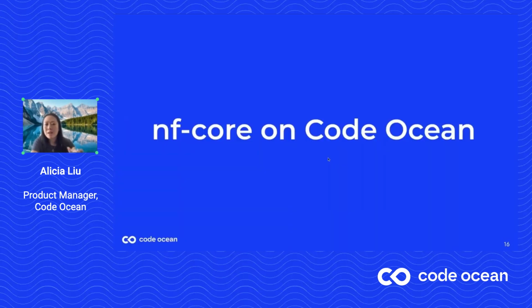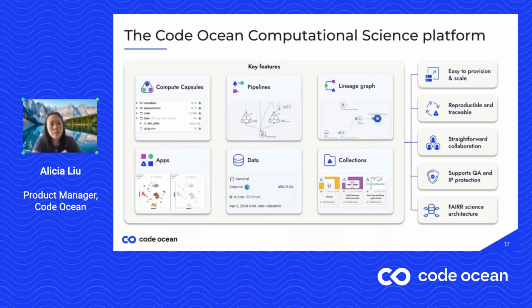And now I am going to cover NF Core in CodeOcean. I'm just going to show the whole process in a demo on our system. So how to import your pipeline, how to run it, what a result looks like, and how you can integrate NF Core into your workflow. But before we do that, for anyone in the audience who isn't familiar with CodeOcean, I want to give a very brief introduction on who we are and what we do.